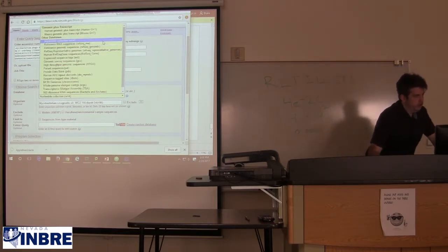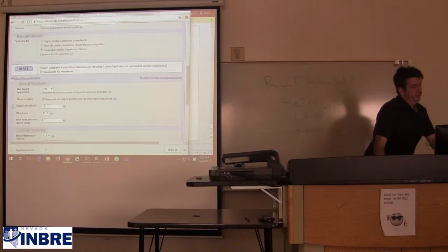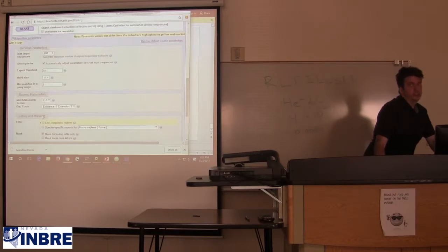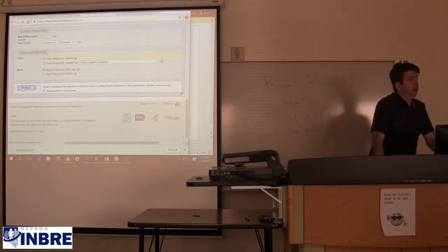Oh, and it came back already and it said, no significant similarity found. Which algorithm? Megablast? Yeah, Megablast. Then I'll take a shortcut and see what happens if we try to do it with blastn with its smaller word search sizes. Okay. And I'll just try to stack the deck as well and make it not mask for low complexity regions, right? There's not a biological reason why the sequences that accidentally get stolen have to be complex. It could be stealing what is not terribly useful to the bacterium and repurposing it. We might get hints of that.